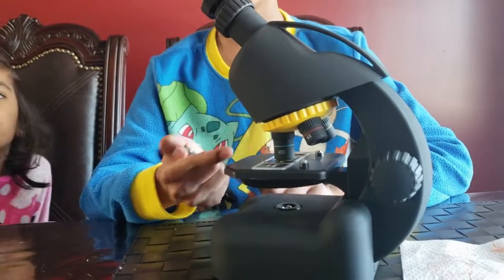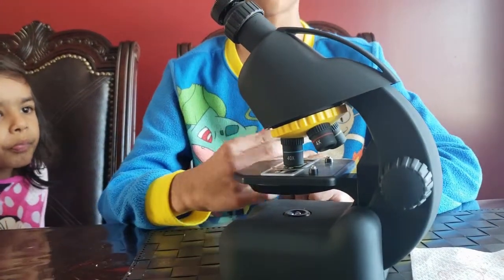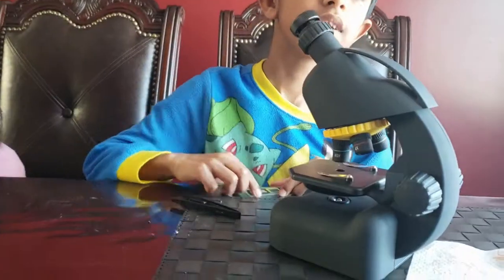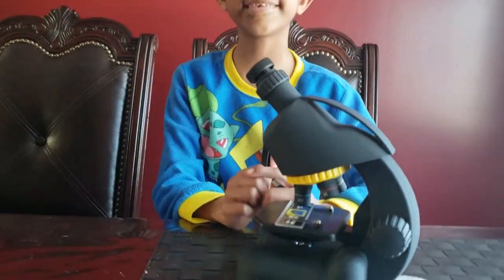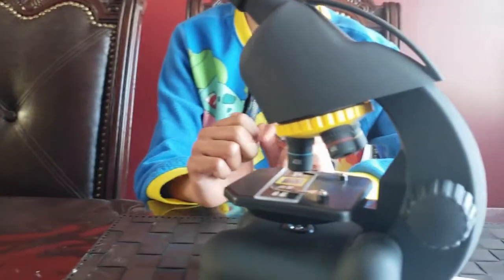And then, we have the stage. The stage is where you put the specimen. So, this is the specimen. You put the specimen like this. The stage holds the specimen, and the stage clip puts the specimen in place.